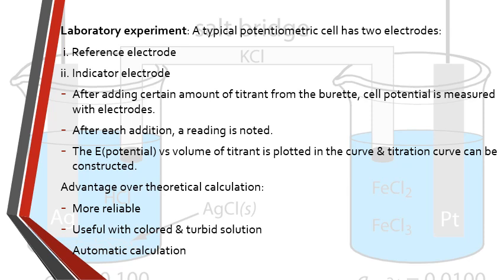We select a titrant, a solution of known concentration, that will react completely with the analyte in solution. The choice of titrant depends on the type of reaction, be it acid base, redox, precipitation, and so on, the type of the reaction that is to be monitored.